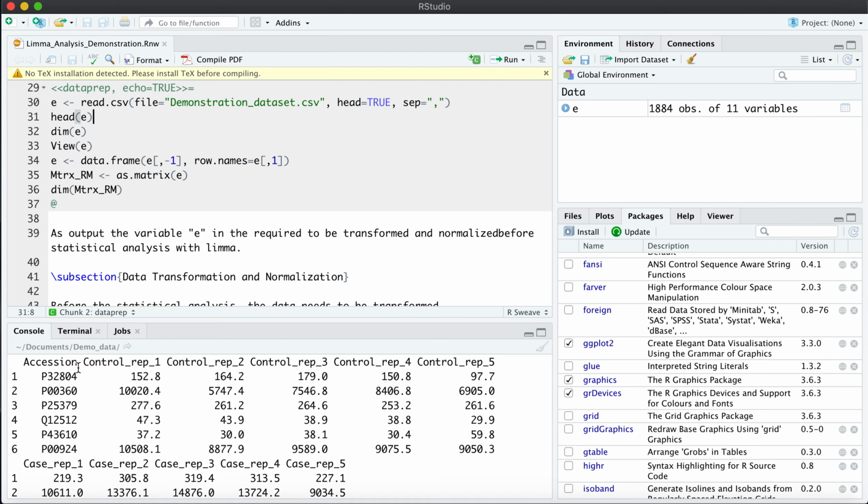In the first column we have the protein accessions. Those are already given to us from Proteome Discoverer. This dataset has not been normalized nor scaled. These are directly processed through quantitation and Proteome Discoverer analysis, and they were identified with a given protein accession and description.